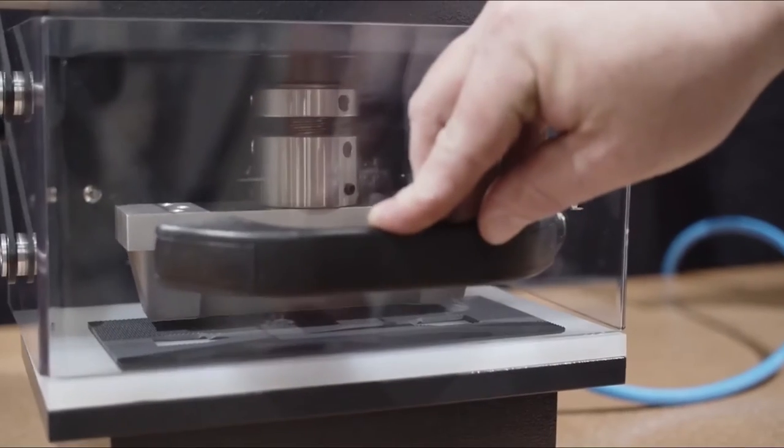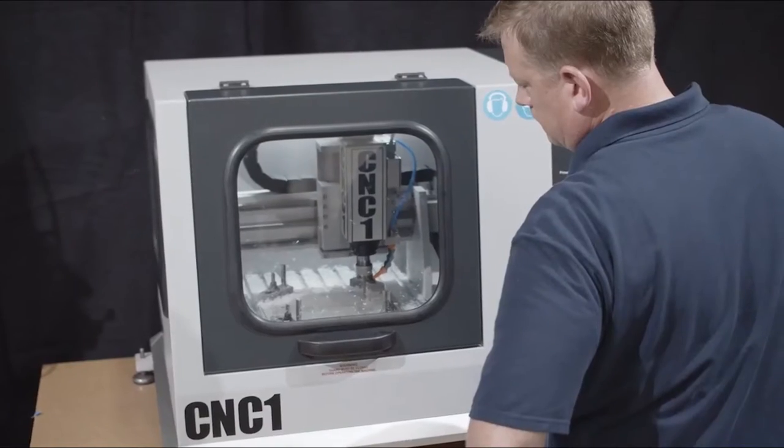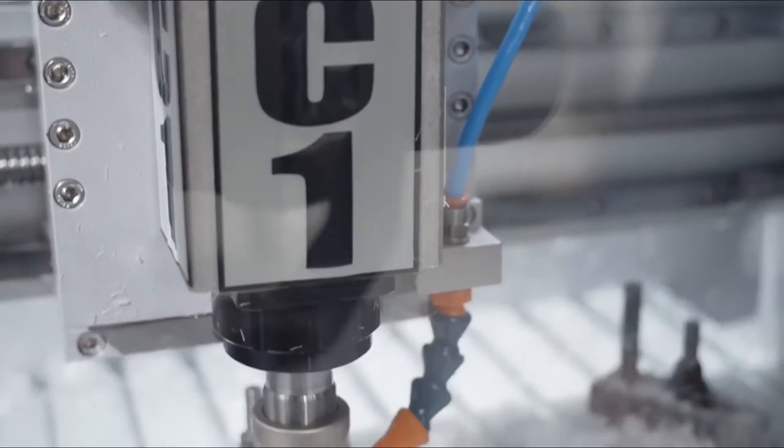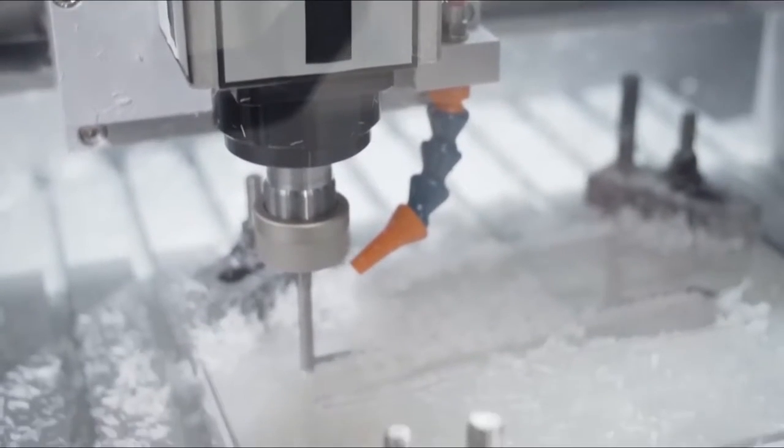From basic, manually operated sample cutters to advanced CNC cutting machines, this versatile line of sample preparation equipment can be used in any materials testing laboratory.